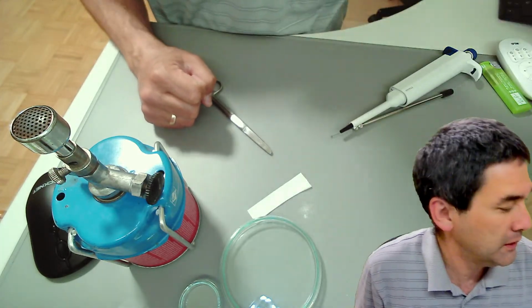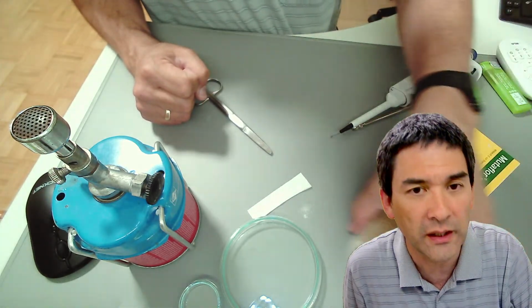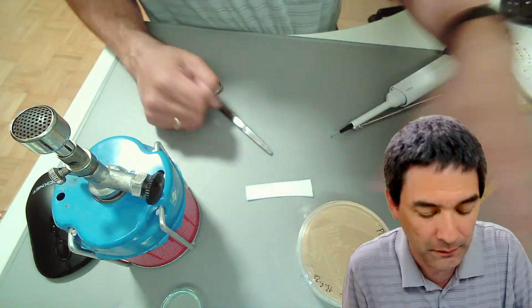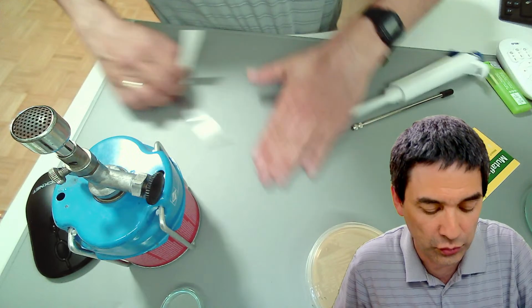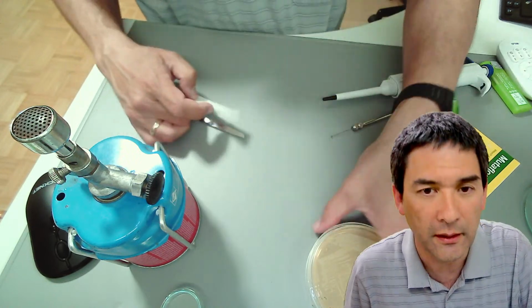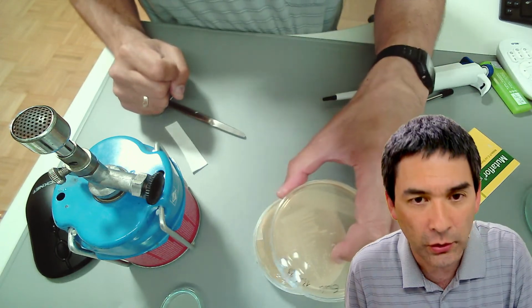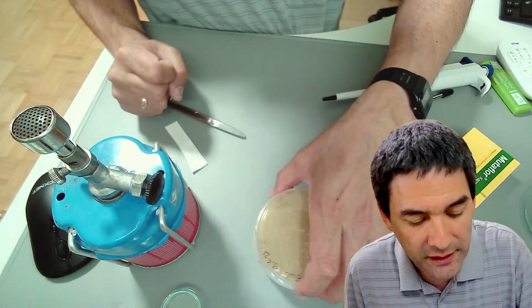The plates that I'm using right now are commercial plates that I bought over Amazon. They're actually designed to grow fungi, but I was also able to grow bacteria. So this plate I already made. And now let's talk about bacteria.